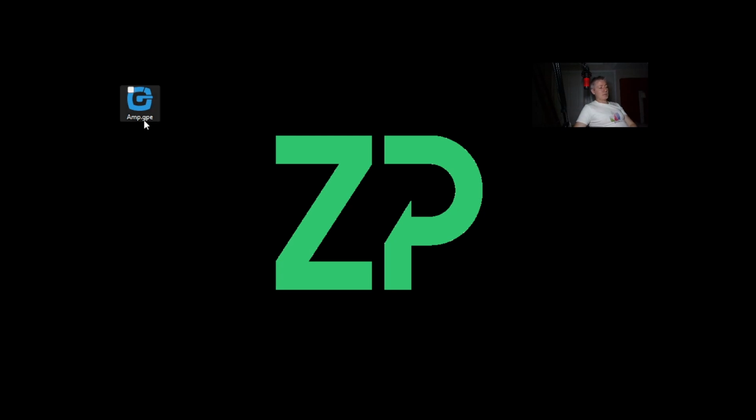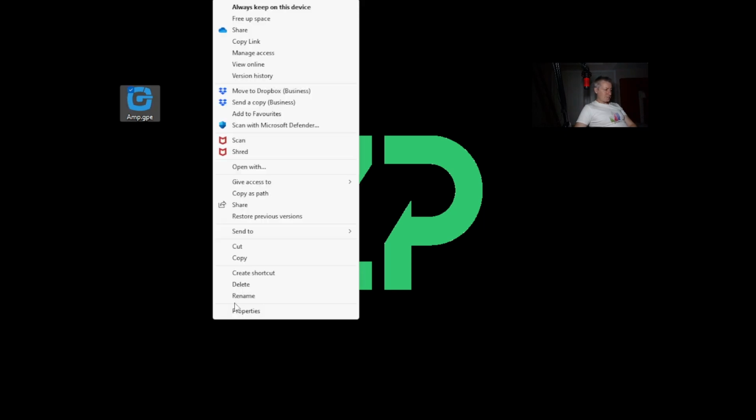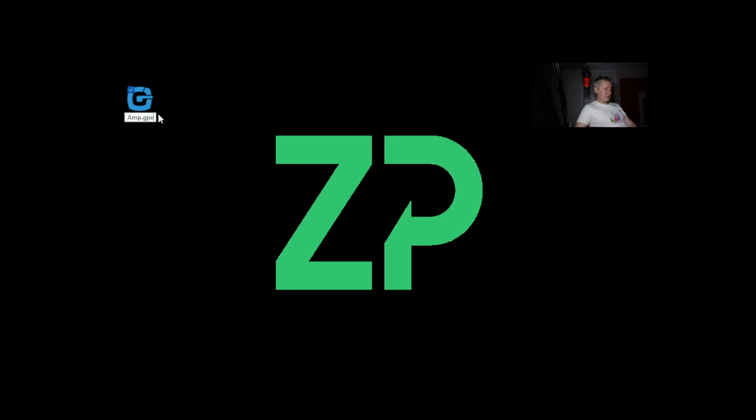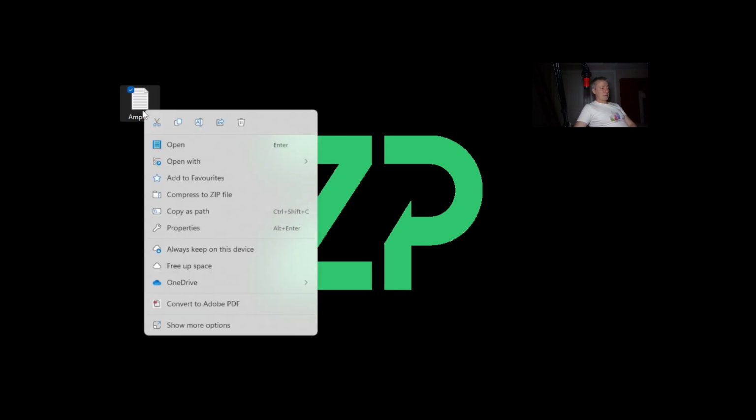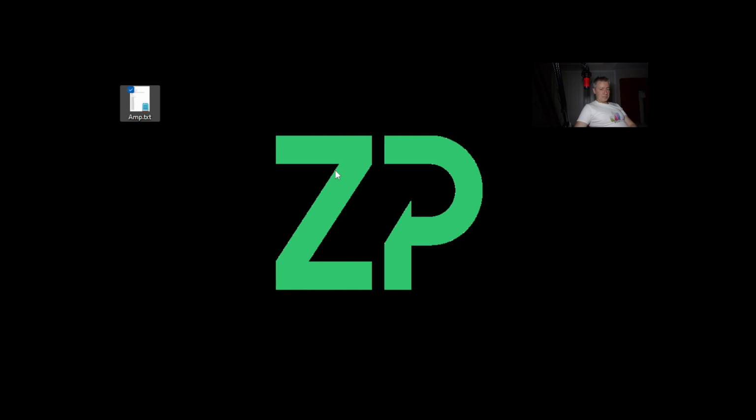So the first thing I'm going to do now is just show you what I'm going to do to this. I can tell from the file name, it says amp, so this is amperometry, and they've got this file format which is called GPE. The first thing I'm going to do is rename it, so I'm just going to change it to a text file. I'm sure there's a smoother way of doing this, but I'll just change it to a text file. The next thing I'm going to do then is open it with Excel. I'm literally doing this on the fly.